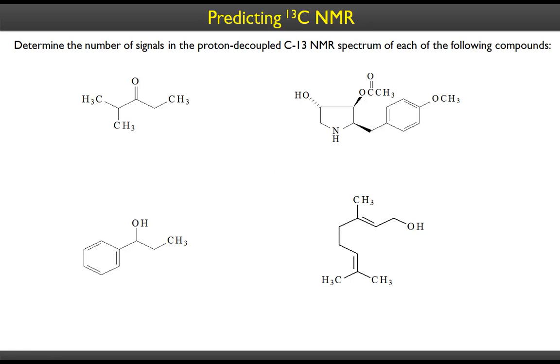There are some programs. ChemDraw, for example, has a tool that can predict the carbon-13 NMR. Quite accurate. So sometimes it's as we expect, right? If you do the NMR experimentation and obtain the carbon NMR, it would be the same as the one that is predicted, because there are so many computational tools these days, so many data points, and you can load all those things and develop software that would assign NMRs for unknown structures.